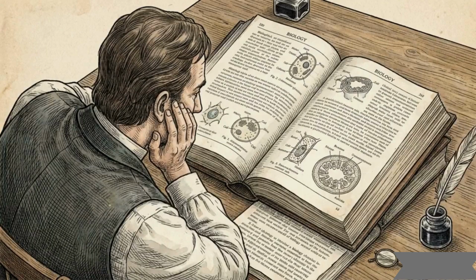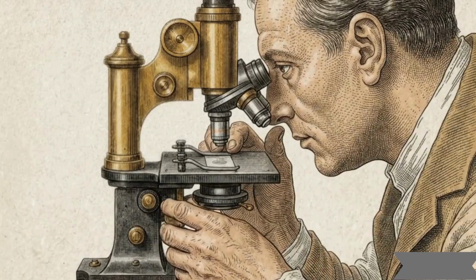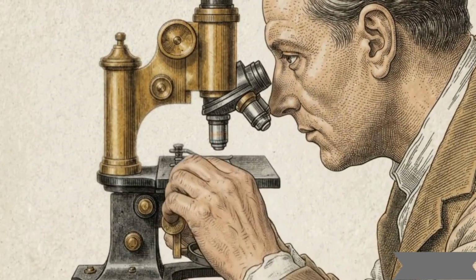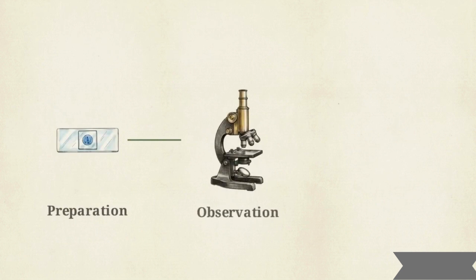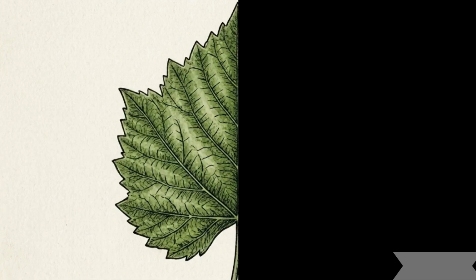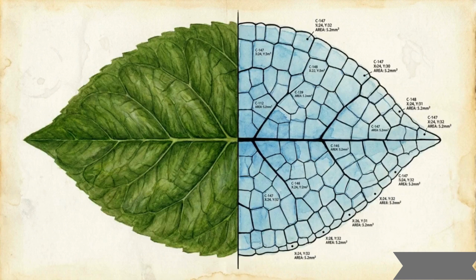A student who relies on being told the answers remains a passive observer. However, a student who prepares the slide and performs the math has the tools to verify their own findings. These skills, from slide preparation to mathematical calculation, allow a researcher to produce repeatable and verifiable results from a raw specimen. Combining slide preparation with the magnification formula allows the learner to move beyond simply seeing a cell and begin quantifying the actual physical dimensions of life.